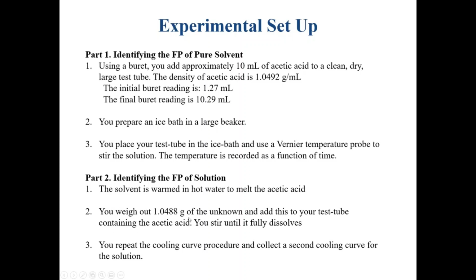So from this, we have the mass of the solute that we're putting in. Then you stir until it fully dissolves. Then you repeat the cooling curve procedure and collect the second cooling curve for the solution. So again, we're going to have our ice bath. We're going to cool it down. We're going to measure the temperature as a function of time, and we're going to get two curves.